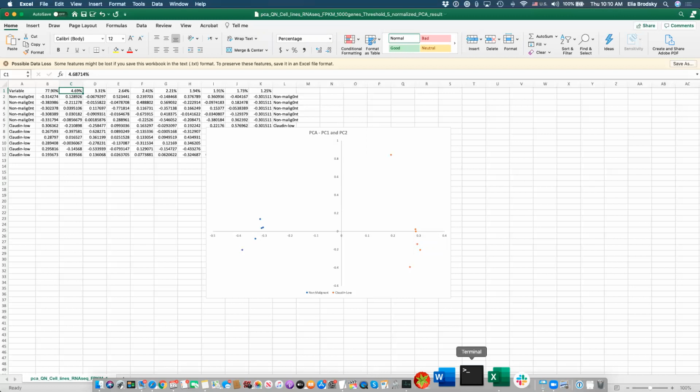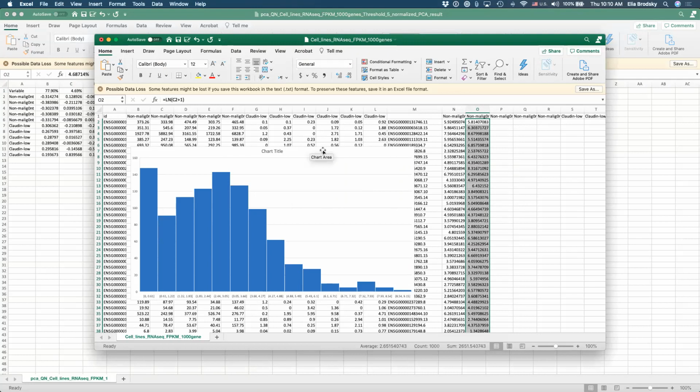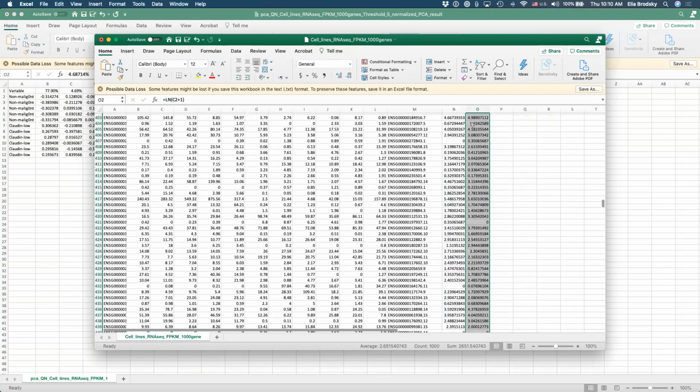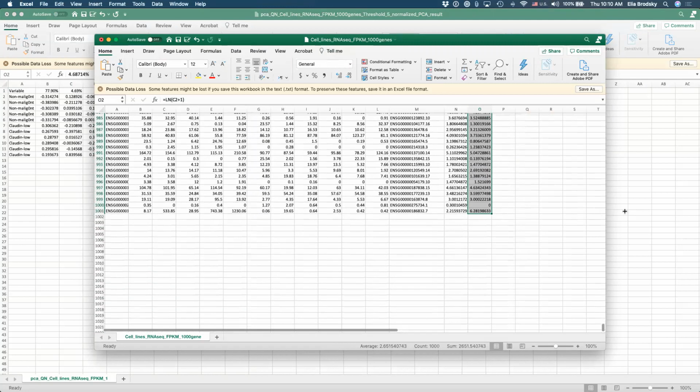All right, so for the sake of time, we don't have that much time left. So let's turn to statistical analysis. This was exploratory analysis. I now understand what the majority of my data tells me. But how do I find the specific genes that can illustrate this difference between these two different sample types? Let's go back to our original data set. So this is our original data set. And let us create a statistical test. Okay, the statistical test will be for our observations. I'm just going to extend this a little bit.